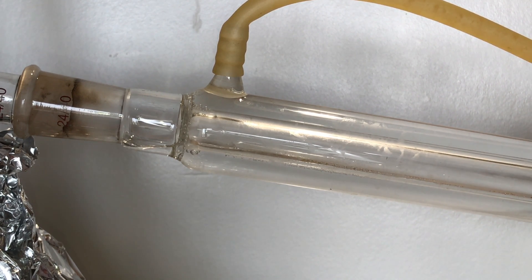In detail, you can see that the sulfuric acid vapors quickly condense in the first two centimeters of the column.